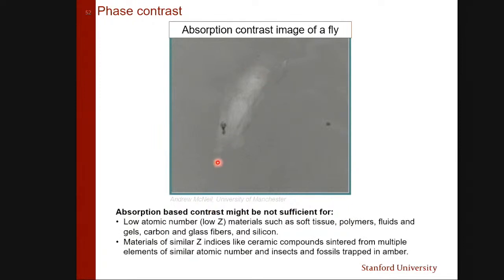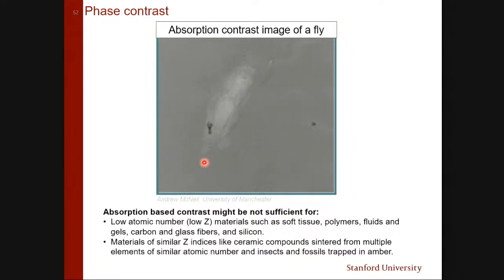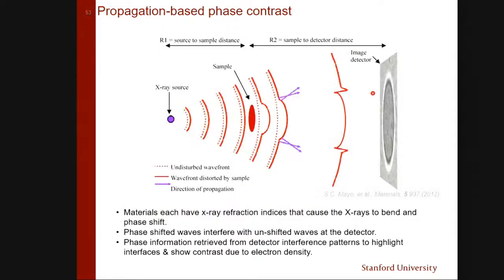But if we, for example, keep the object and move the detector farther away, what happens when the X-rays go to the object? Mind that this is from optics, maybe some of you understand: there is a refraction of rays. Different materials refract X-rays differently. So you have a little bit of phase difference of rays which pass through material and through the background. This phase then would propagate towards the detector, and you can detect edges, which result in intensity differences, like spikes here, okay?